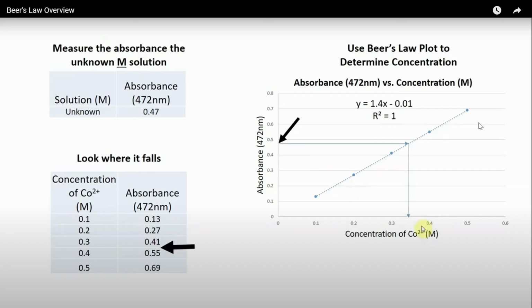I feel though, like, even if you had a cuvette with nothing in it, the cuvette itself will absorb a little bit of light, which is probably why the B value is not 0. Does that make sense? And even if you just have water, that's one of the reasons why, and we didn't talk about this, before you start any experiment, you put a blank in and set that to 0 so that that takes care of your cuvette and your solvent.